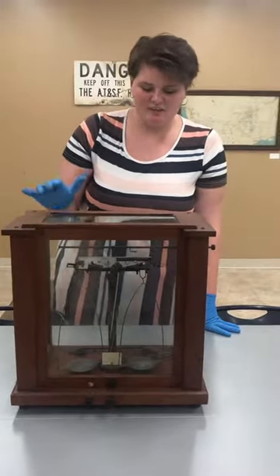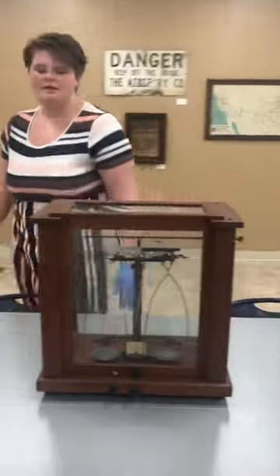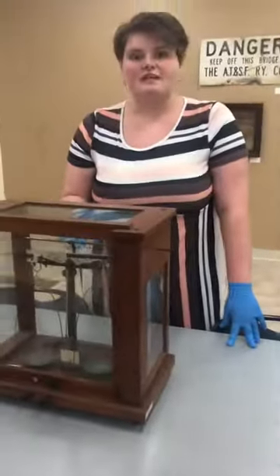This one is from the 1920s. It's patented by Volan and Sons in 1912. I don't know much about this brand, but this specific model is still used today — they're so precise.